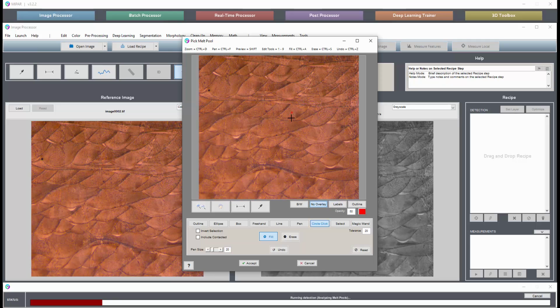And we've been in discussions with some folks that have rightly pointed out that mirror symmetry may not physically be ideal, that because there is a liquid-powder interaction, there could be a more physics-based way to estimate the hidden portion of the pool, and we're taking a look at how we can incorporate that in. But for this particular workflow, it worked out well to make the assumption that the pool would be symmetric about its vertical axis. So that's what's used in this solution.